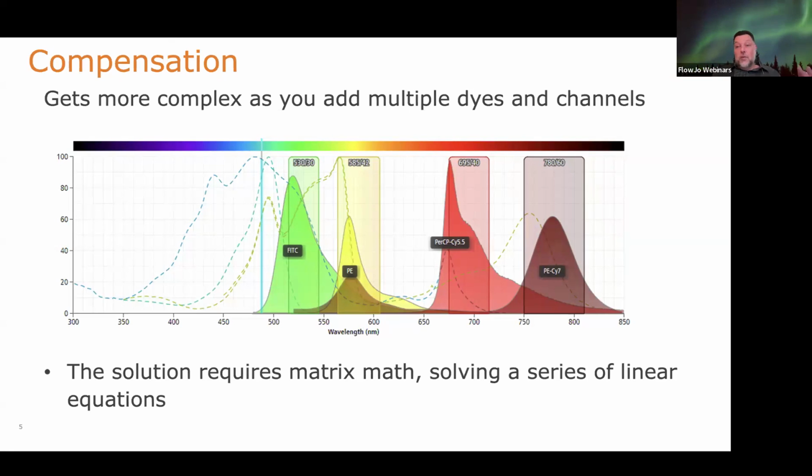So I'm not going to focus too much on the math. I'm going to give you a little bit of math, but it's not my specialty. I'm an immunologist. You're probably mostly life scientists. Let's let the computer do the math. We can just concentrate on the end results that we get out of performing these calculations.